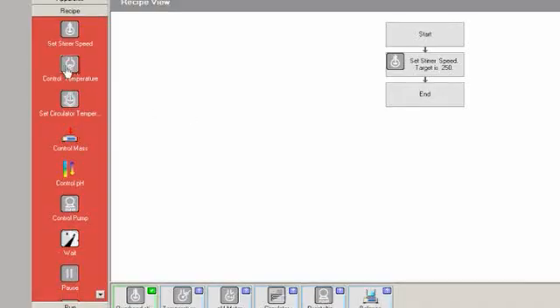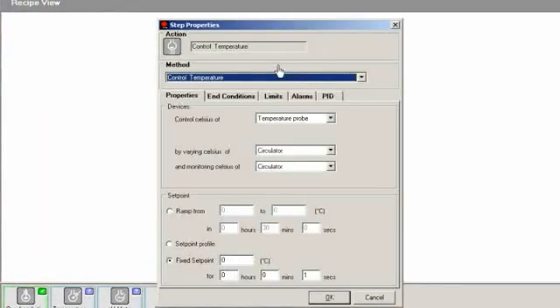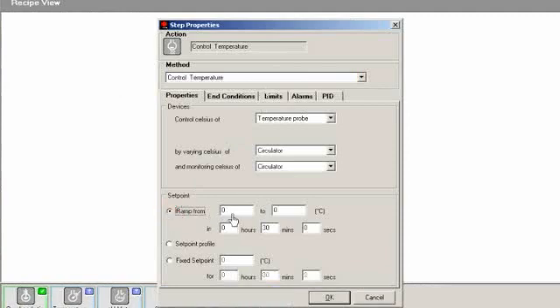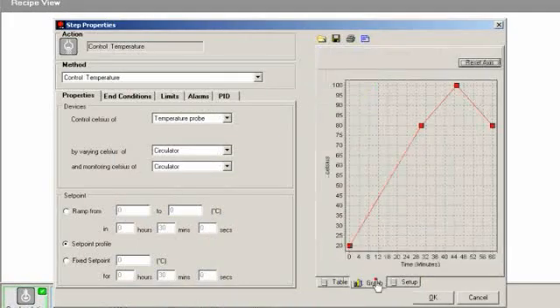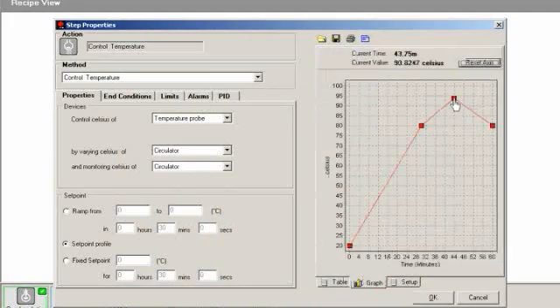In the recipe view, steps can be created in series or parallel by dragging on action icons. Set points, ramps, or sophisticated profiles of control parameters can be set using tables or graphs.